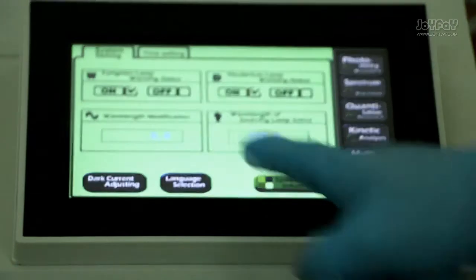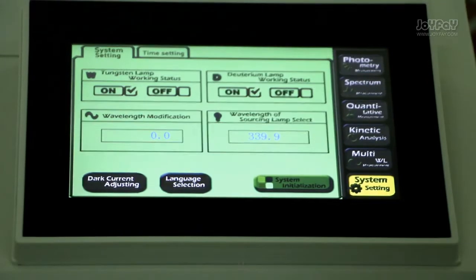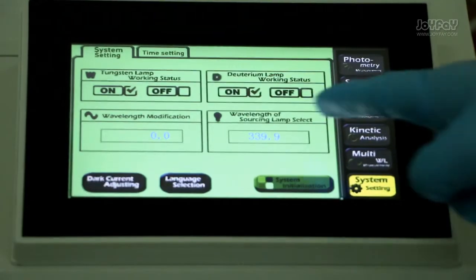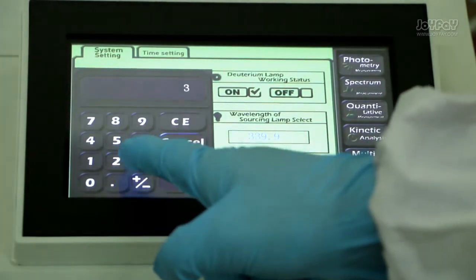Measure the standard value. The correction range is plus or minus 0.5 nm. Press the blank box to enter the wavelength in the world.